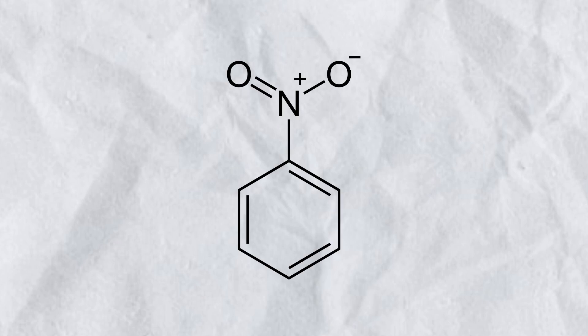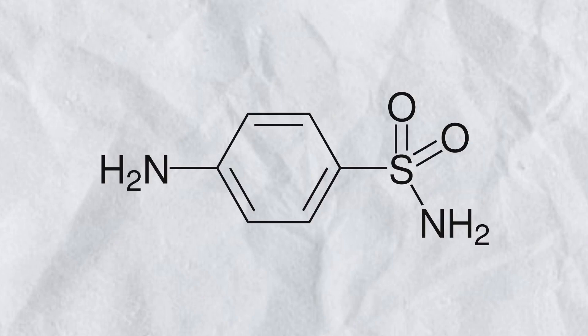In today's video, I will be making nitrobenzene. The nitrobenzene made in this video will be used as a starting material to make sulfanilamide.